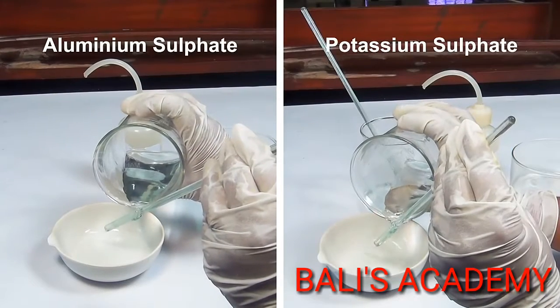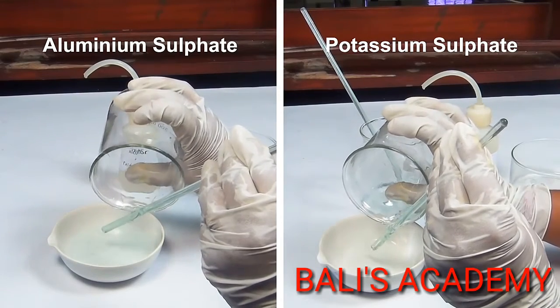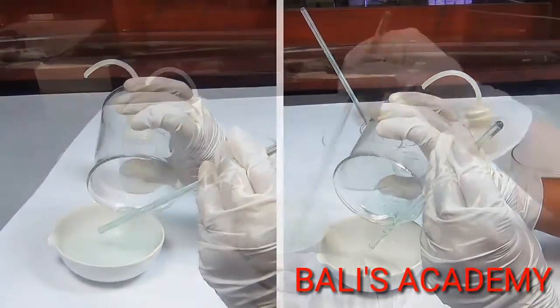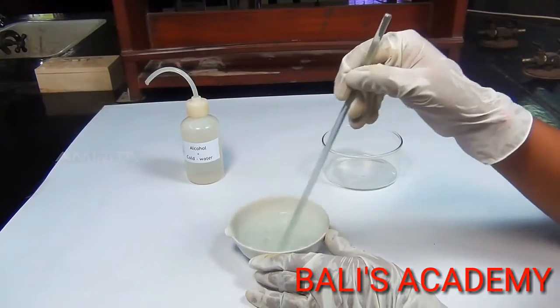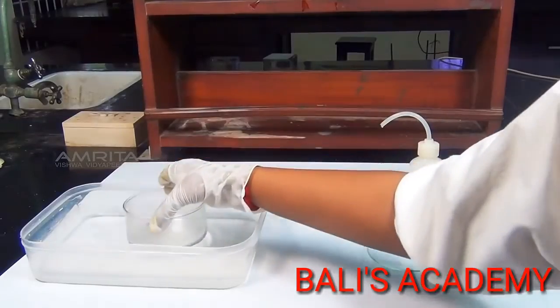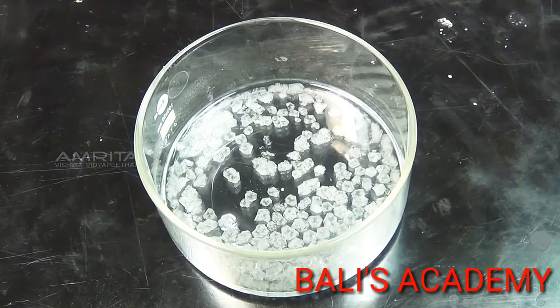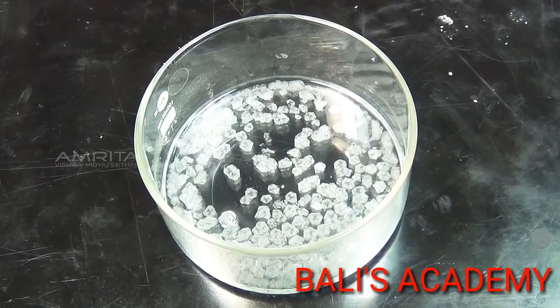It is prepared by dissolving an equimolar mixture of hydrated aluminium sulphate and potassium sulphate in a minimum amount of water containing a little of sulphuric acid.